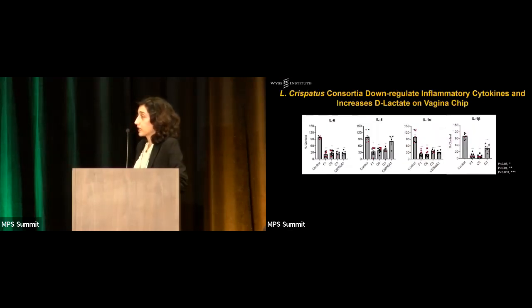Also, cytokine analysis shows that the presence of the Lactobacillus crispatus and its colonization for 3 days significantly reduces the pro-inflammatory cytokines, presented here as IL-6, IL-8, IL-1 alpha, and IL-1 beta, both for the consortia as well as for the single strain.